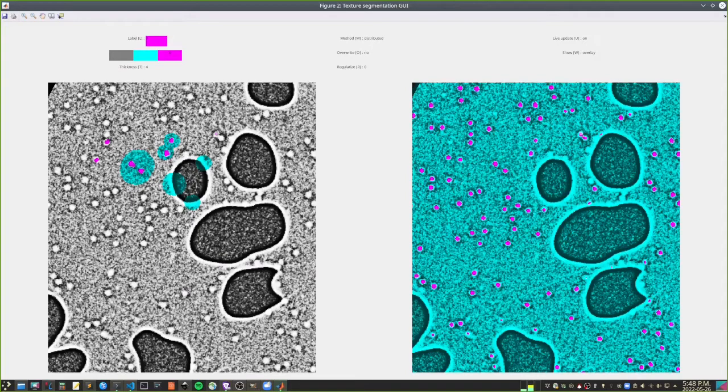There's one completely missing here. Okay, now it's starting to make a few mistakes, but it's not a problem. We can deal with those later.